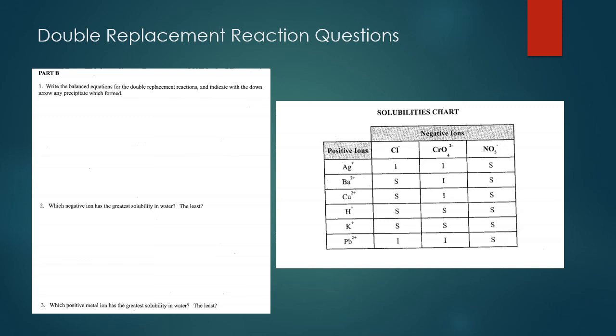So let's look at the last example that we just saw. So we just saw potassium chromate reacting with barium chloride. So when this happens, a double displacement reaction occurs and we have barium switching places with potassium. So barium on the product side is going to be with the chromate ion and potassium is going to be with chlorine. Now we did see a solid form. In the previous slide we saw a pale yellow cloudiness form. So that means a solid did form.